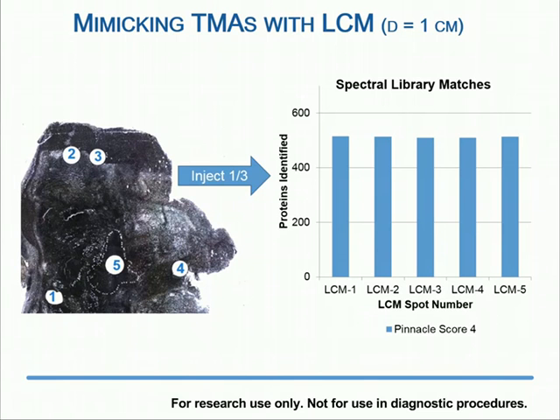We also probably need to be a bit clever about how we're processing these samples and either do this in minimum volumes or prepare them perhaps even in the autosampler vials that are going to be used for the injection, so we can concentrate as much as possible and transfer the entire sample through to the mass spec.